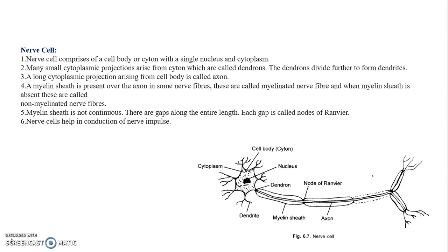That's why they can have control over our whole body, along with the internal organs as well as other activities done by any organism in a sequential manner. So nerve cells have these characteristics, and if you see these characteristics under a microscope in a certain cell, you can infer that this cell could be a nerve cell.